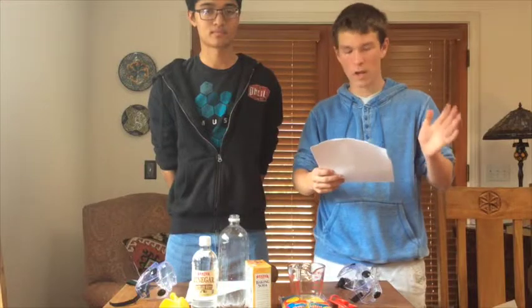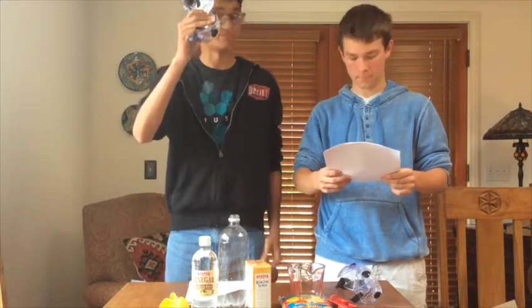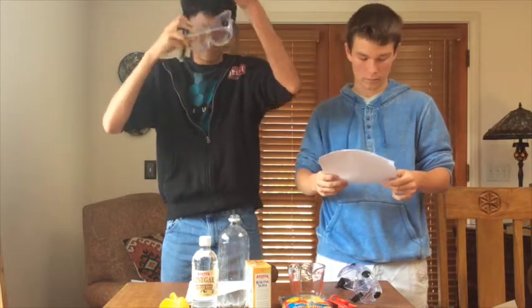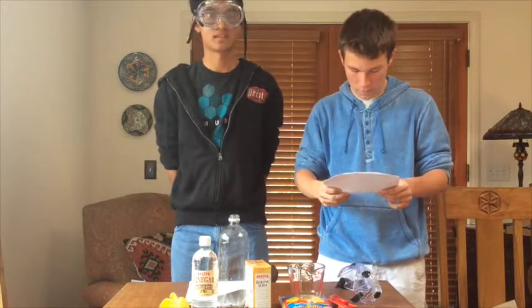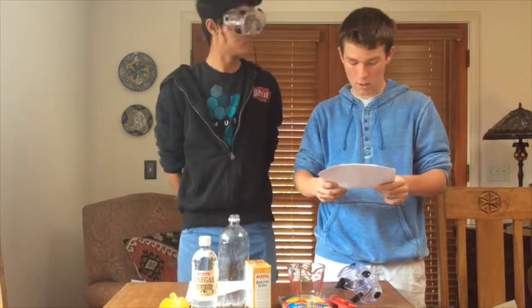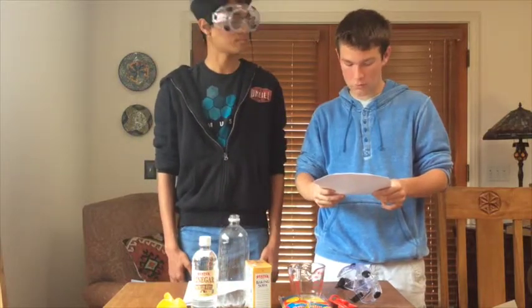Experiments are no fun if somebody gets hurt, so be careful and pay attention to these safety rules. First, you should always wear your goggles in the lab. Goggles protect against chemical splashes and projectiles. You should also never touch any of the chemicals with your bare hands unless a knowledgeable adult deems it safe to do so. If you get any chemicals on your hands or other body parts, immediately wash the substance off and alert a teacher. If a chemical spills, stay away and tell a teacher so they can come and clean it up.